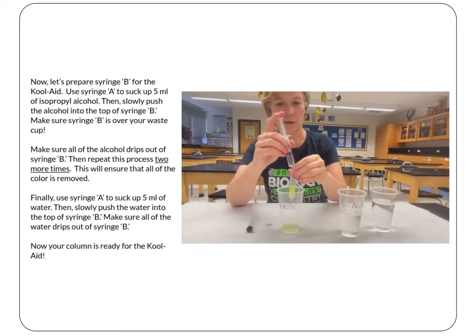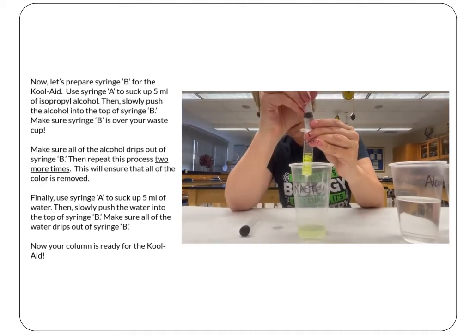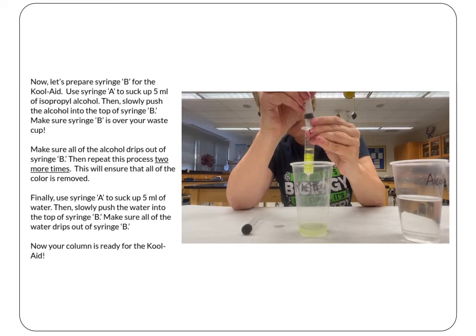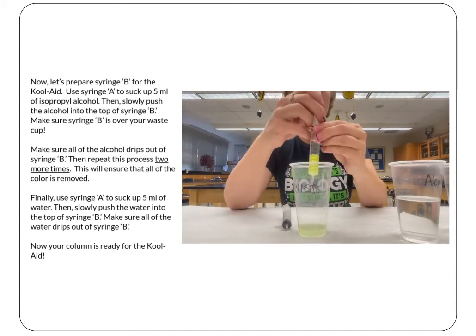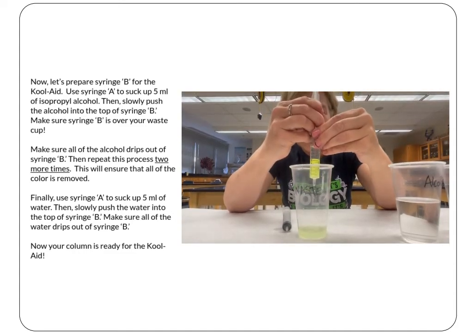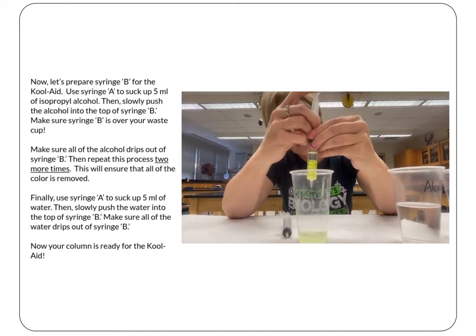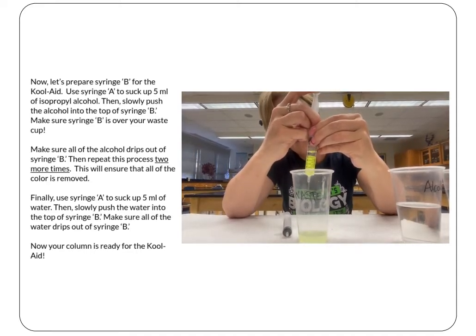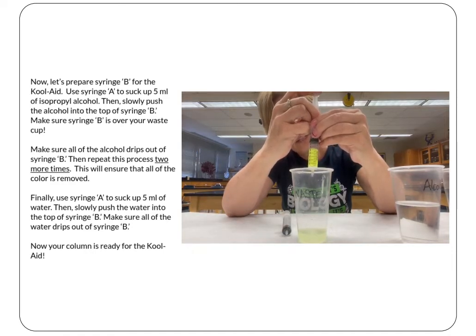And again, I'm going to put this into the syringe. And this time it's just water in there, so we're going to rinse this out. Now this is preparing the sand so that it will attract hydrophobic molecules that are a little bit afraid of the water, and that's going to help us to separate things out. All right. You can see why it's important to have a waste cup as well.